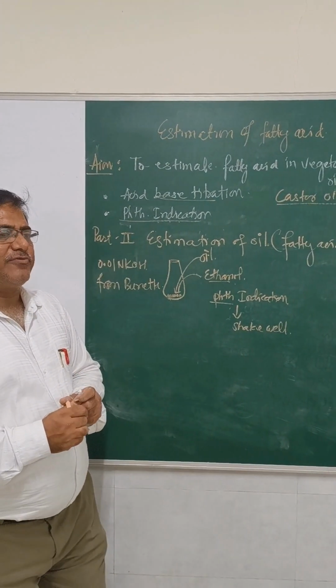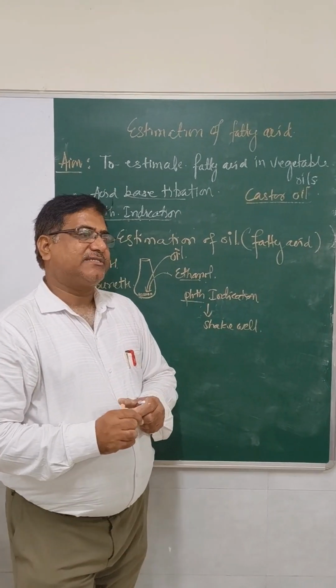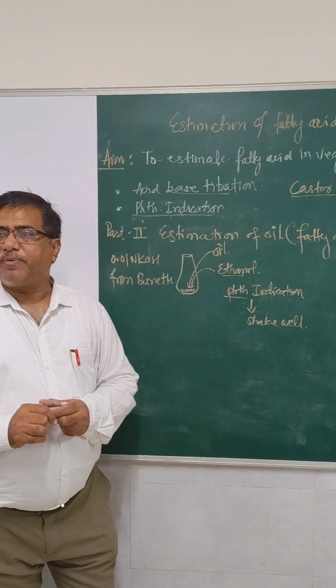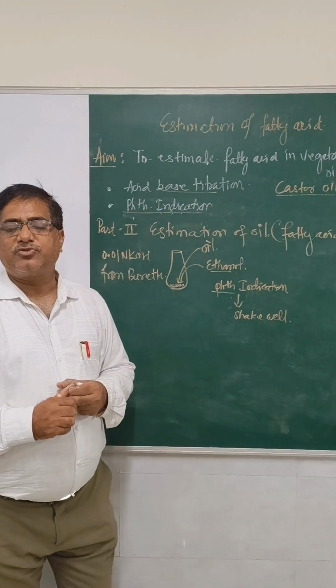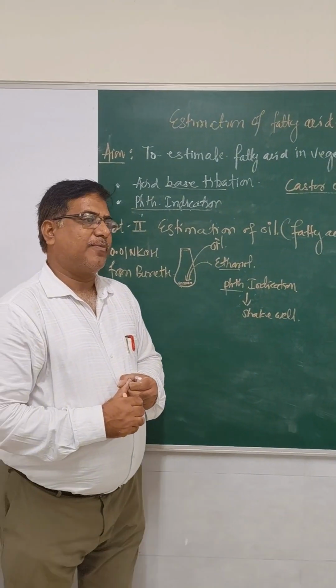And by the calculation, you can calculate the amount of fatty acids present, because we know the normality of succinic acid, we know the normality of potassium hydroxide solution, and we can calculate the amount of acid present.